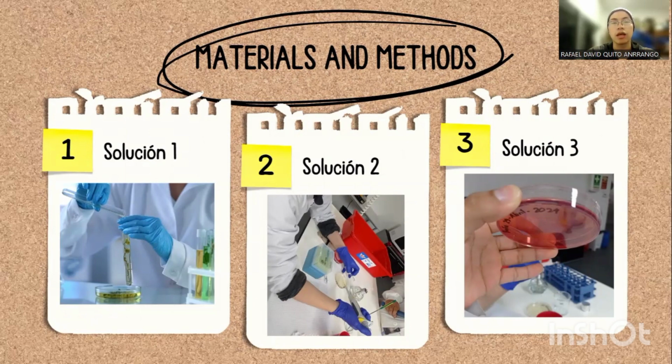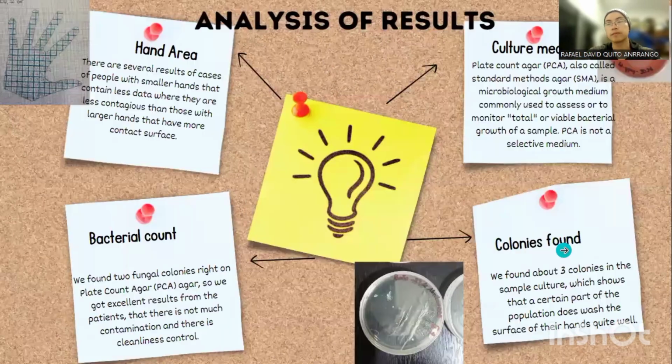availability. Disposable gloves, apron, cap, mask and closed shoes. Incubator, felt pens, disinfectant and cleaning material. Burners or laminar flow chamber. Methodology.